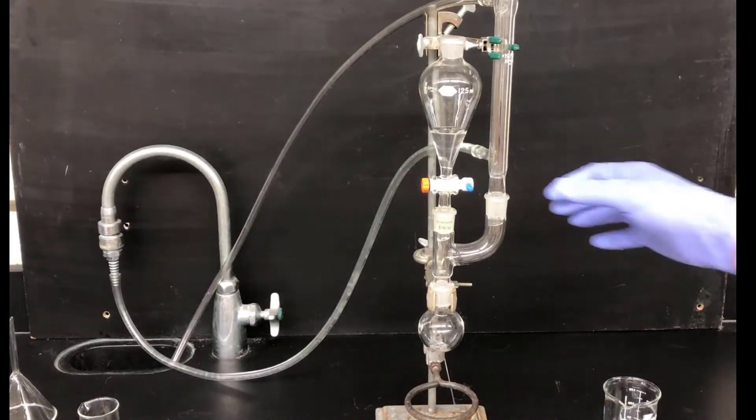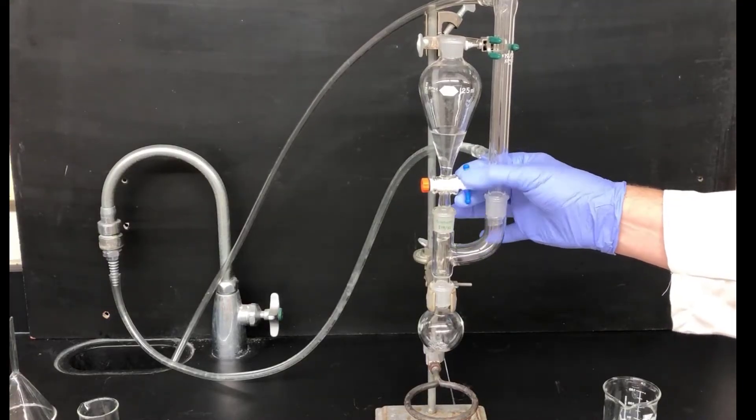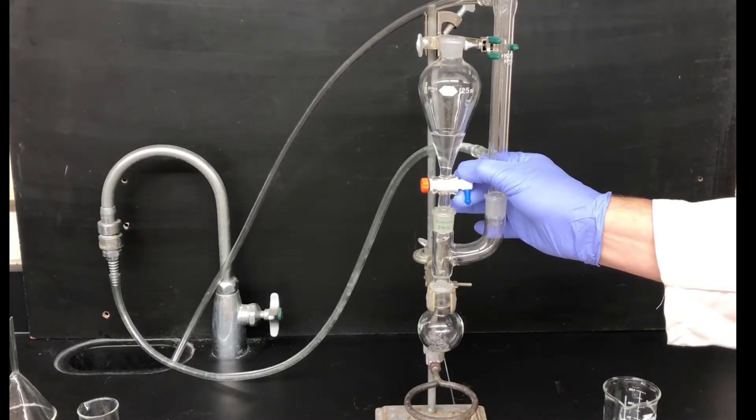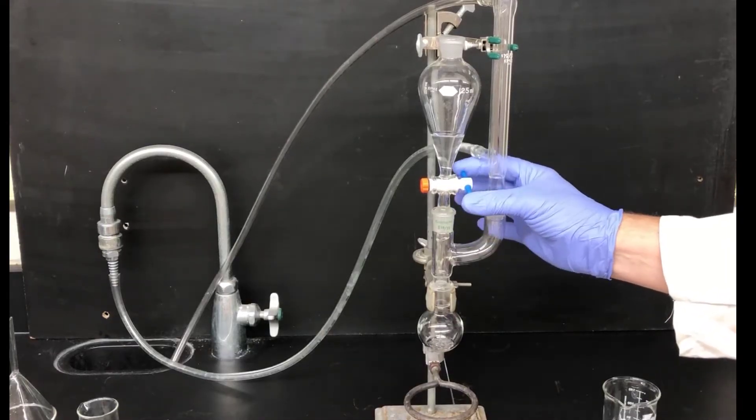Next, I'm adding a little bit of the solution of bromobenzene and ether, just enough to cover the magnesium turnings in the bottom of the flask. This is enough reagent to get the Grignard reagent formation reaction started. Once that reaction is going, I'll add the rest of the solution.